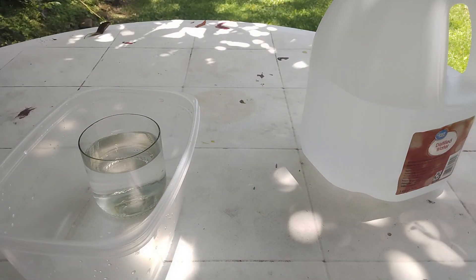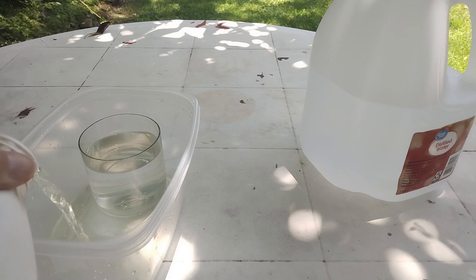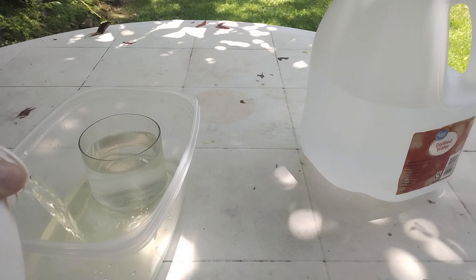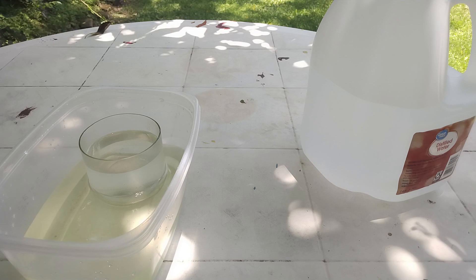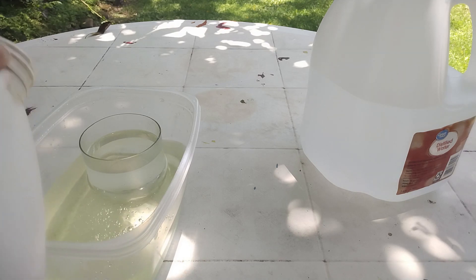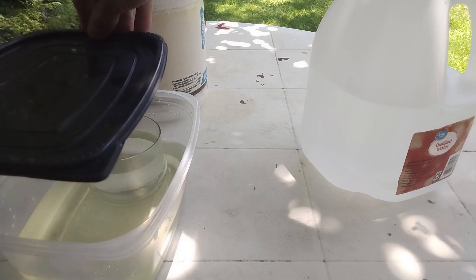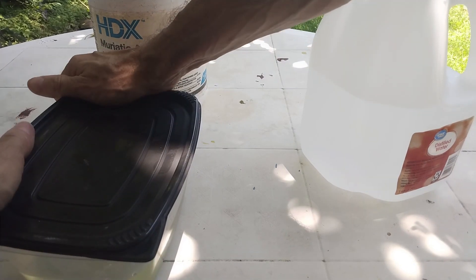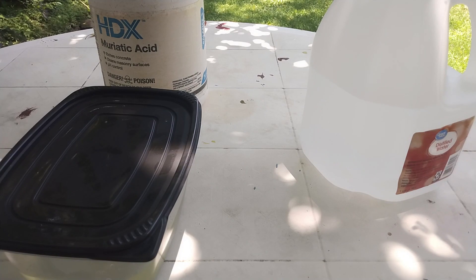I'm going to pour some of this impure acid in the big container. The amount I put should be at least 1.5 times the amount of distilled water that I put in the small container. Once done, place the lid and make sure that it is hermetic.